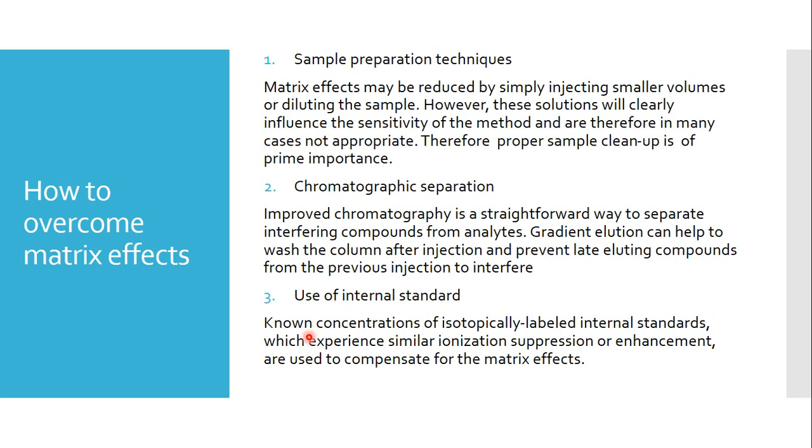So how to overcome this matrix effect? Sample preparation techniques. So this can be reduced by injecting smaller volume, or you can dilute the sample. However, it will hamper the sensitivity. So proper sample cleanup is of prime importance to reduce this matrix effect. The next is chromatographic separation. Improved chromatography is a simple way to separate interfering compounds from analytes.